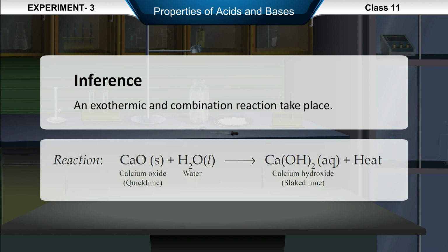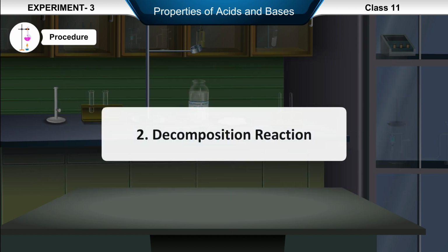Reaction. CaO in solid state plus H2O in liquid state results in Ca(OH)2 in aqueous state with heat.